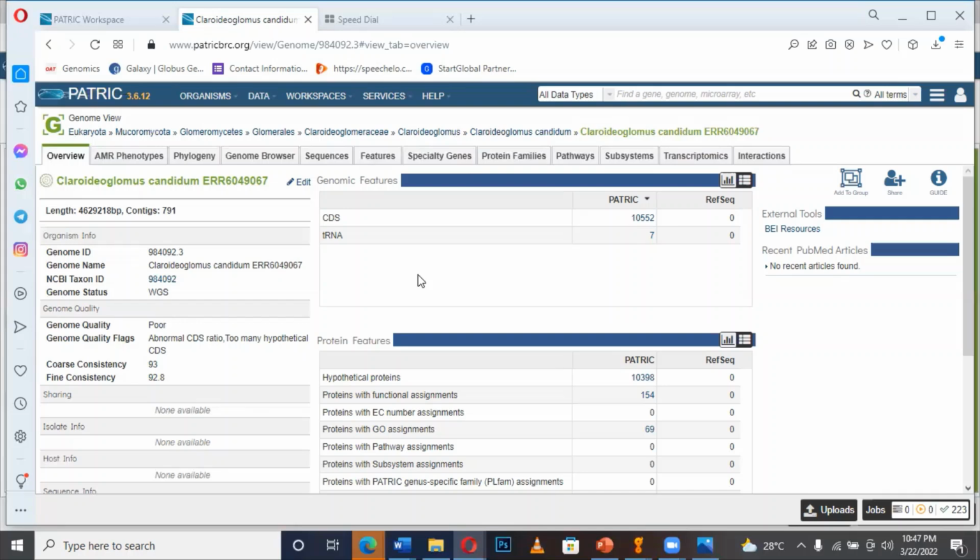What are some of the orthologous genes? How can we find orthologous genes, right? Common genes in different samples. How can we find them here on Patrick? How can we download it? What do we need to do to get a sequence, so that we can do phylogenetic analysis, like based on comparative study. All right.